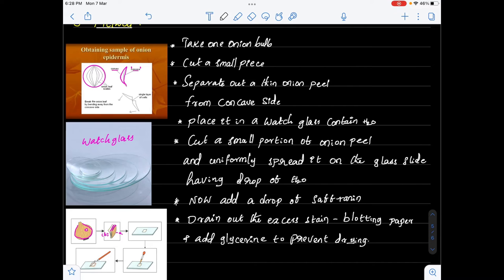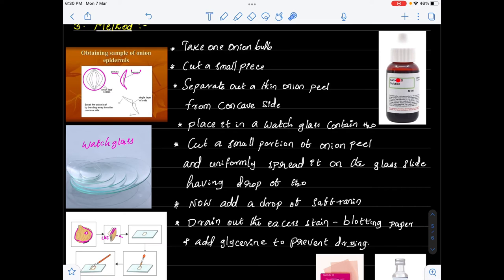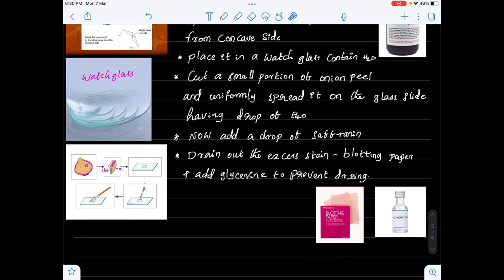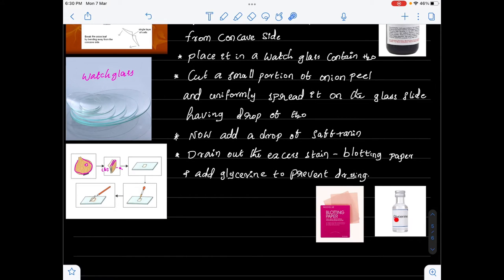Now let me show you the saffronin solution, blotting paper, and glycerin. This is the saffronin solution — it is a coloring reagent. It stains all the components of the cell and gives a pink color to them, so that when we observe under the compound microscope all the components are clearly visible. This is the glycerin; it prevents the material from drying and keeps the material wet for a longer time.